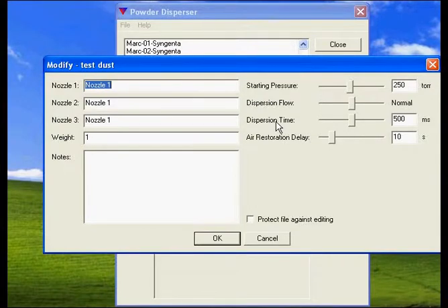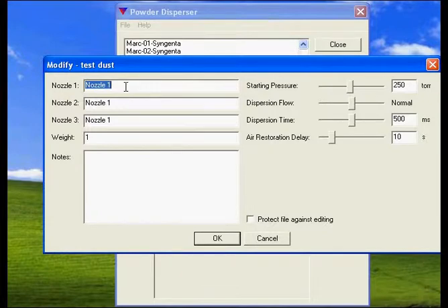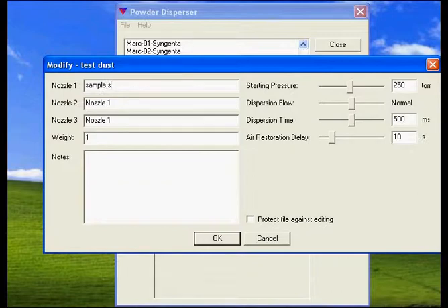And then I will set my parameters. The fields on the left are just for information purposes. In the first nozzle I had the sample holder.